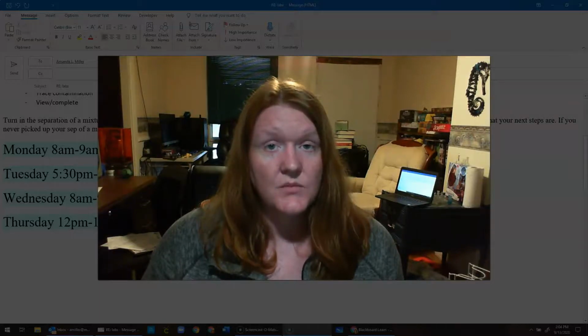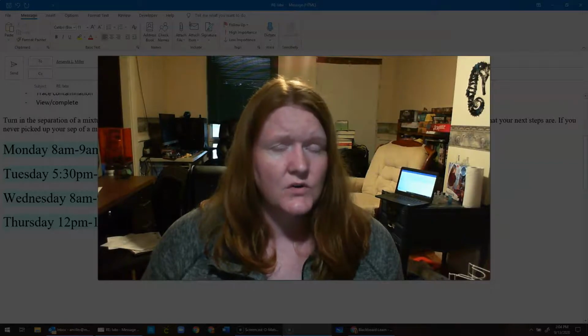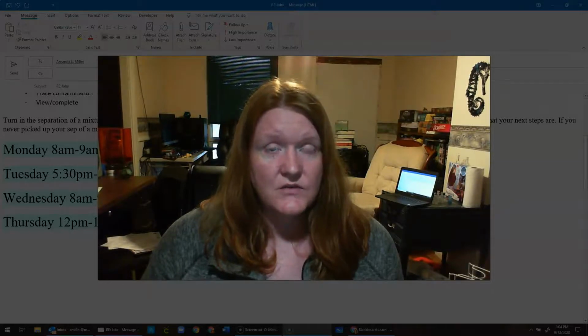I've noticed some people trying to put the solid material in the filter and then pour the water over top. That doesn't work very well. The filters work too fast, and it does not give a chance for things to dissolve. So instead, dissolve it in a separate container first and then pour it into the filter.